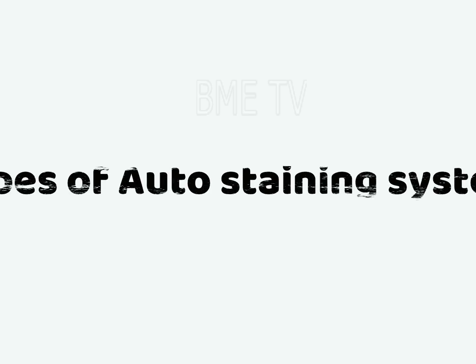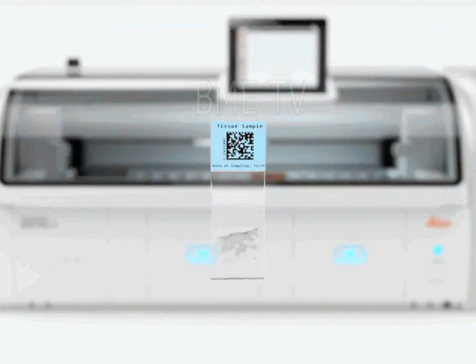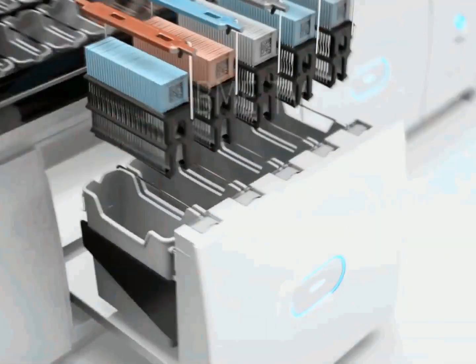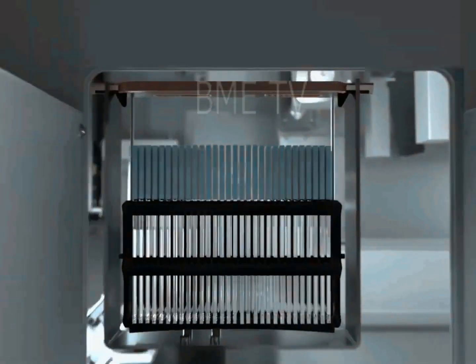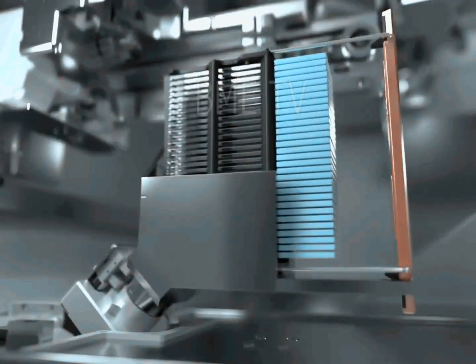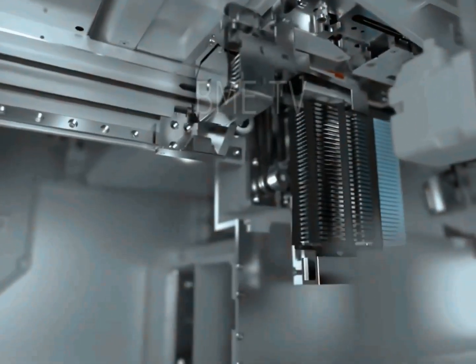Let's look into types of auto-staining machines. Let's start with capillary gap stainers. Capillary gap stainers force or draw the stain between the specimen slide and another surface. A familiar example of this technology is the Platen-type stainer in use for many years in hematology departments for Wright's staining. Rotating worm gears move slides face down along a platen, a plane surface, which has holes through which stain can be pumped at appropriate intervals.